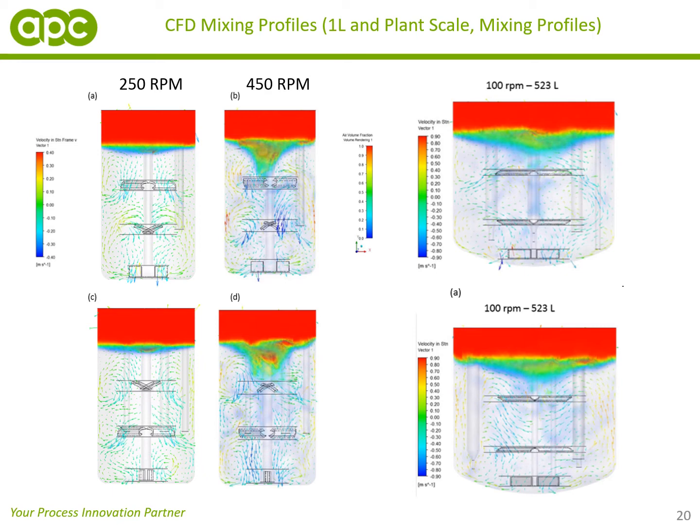But I think what we can conclude from the CFD simulations was that there was an increase, or probably a more aggressive mixing environment occurring on the 1 liter scale, that was maybe subjecting some of the particles in that reactor to greater shears or greater stress.